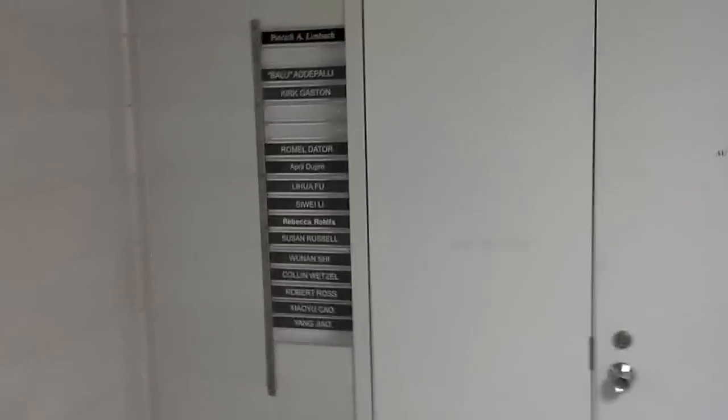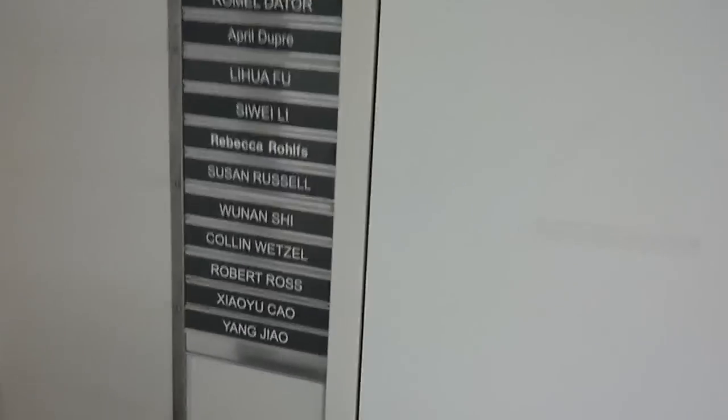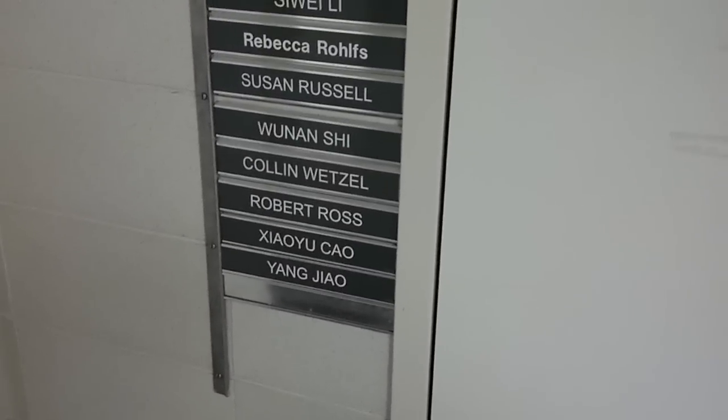So here's the video of my lab. As you can see, my name is on the door.